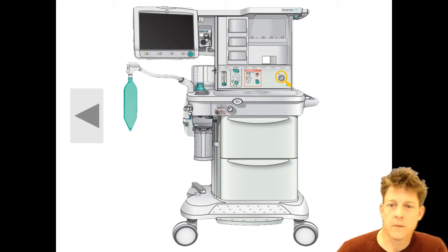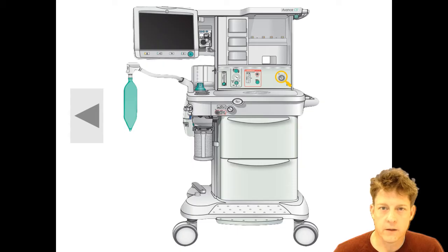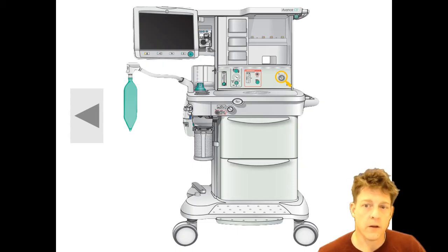Now here is the front of the machine itself, so you can practice going over the front part of the machine for your demos and your education. As you can see by the power switch, the main on-off switch, there's a magnifying glass, and we're going to get to that later. We're not going to turn it on right now. I'm going to go to the arrow on the left-hand side, and this spins the machine around to the back.